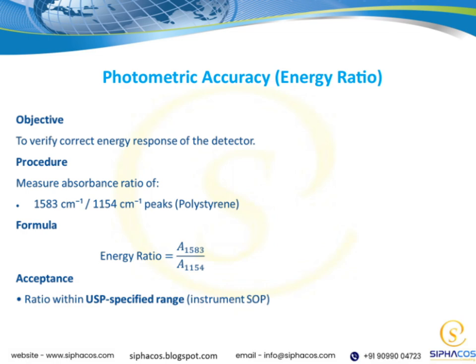Conversely, a lower ratio suggests there might be some inaccuracies or inefficiencies in measurement. Understanding and optimizing this ratio is crucial because it directly impacts the reliability of our data, especially in applications like remote sensing or imaging, where precise light measurements are essential. Throughout this presentation, we've emphasized the importance of accurate data collection. Improving photometric accuracy ensures that our analysis and conclusions are based on trustworthy information, ultimately strengthening the overall quality of our work.